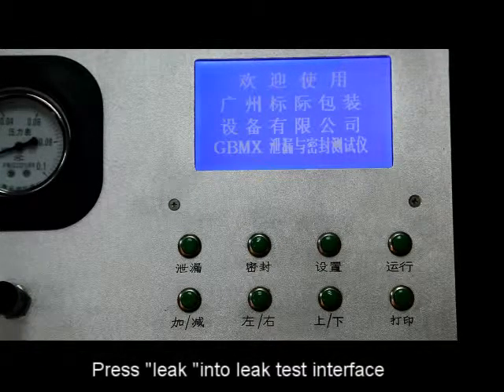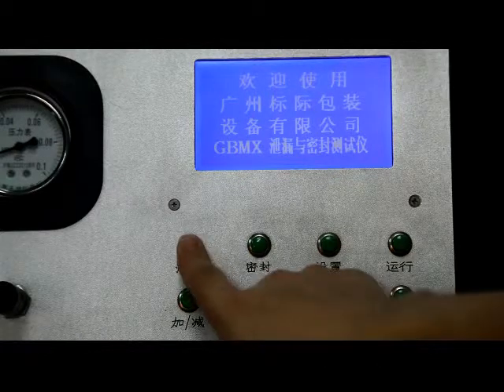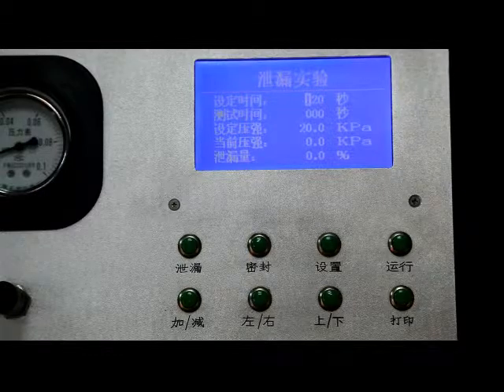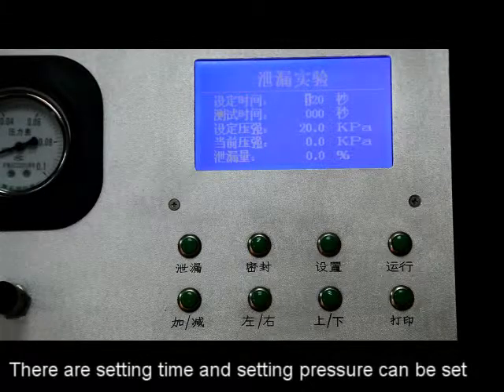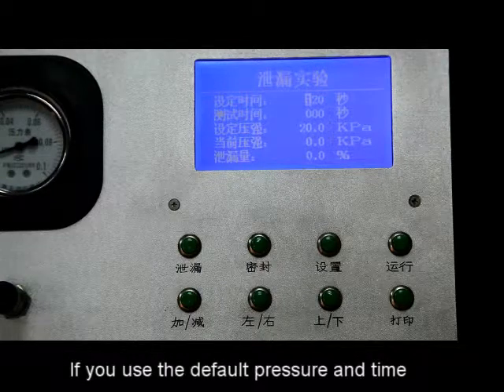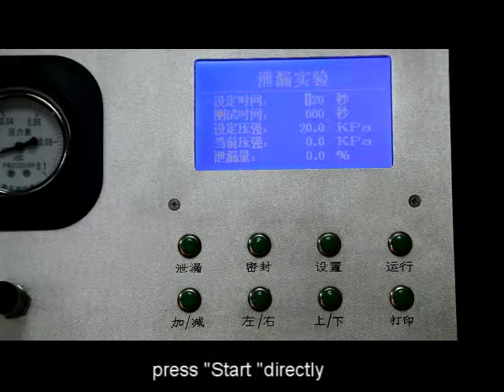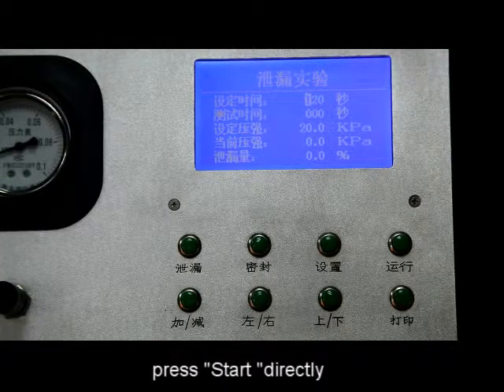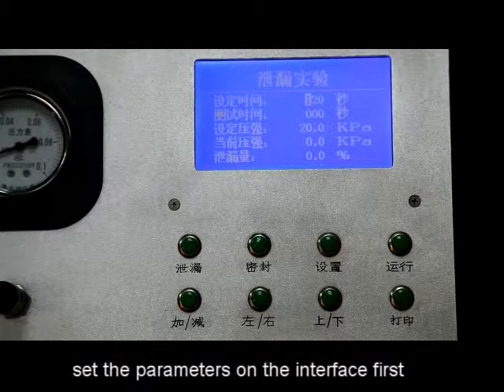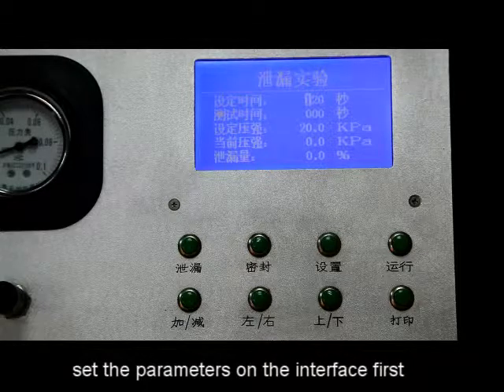Press leak to enter the leak test interface. There are setting time and setting pressure that can be set. If you use the default pressure and time, press start directly. If you need to change the setting pressure, set the parameters on the interface first.